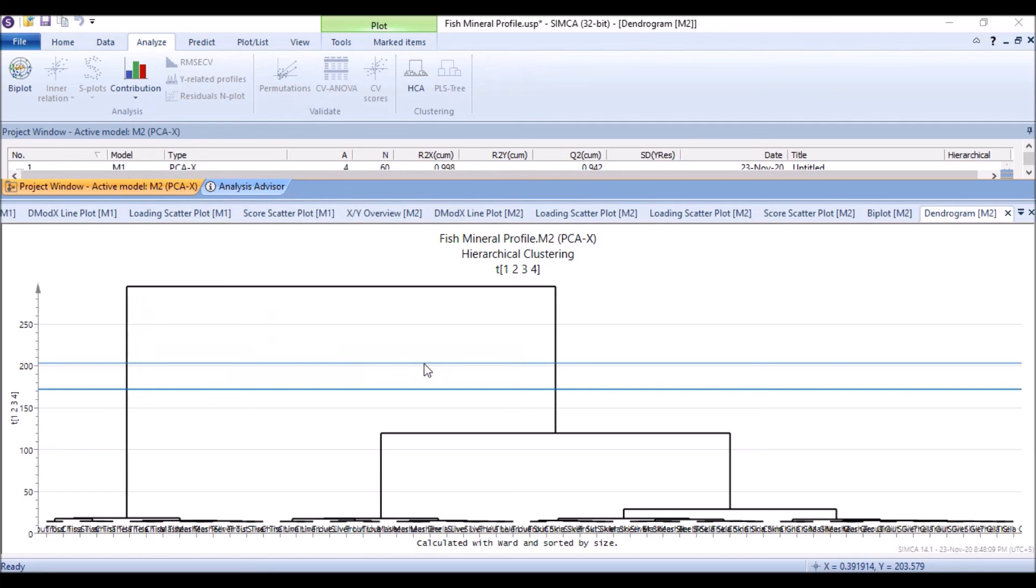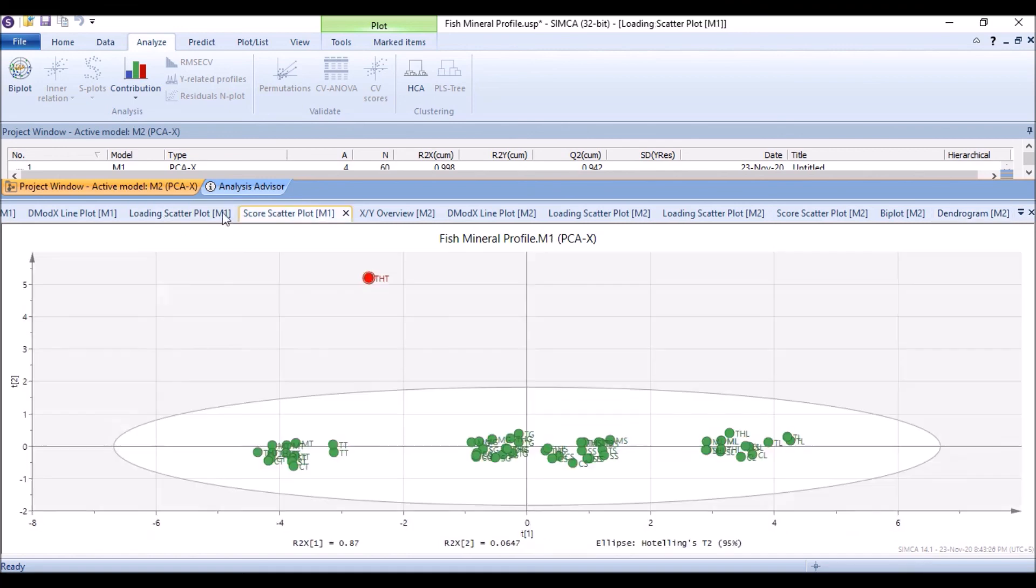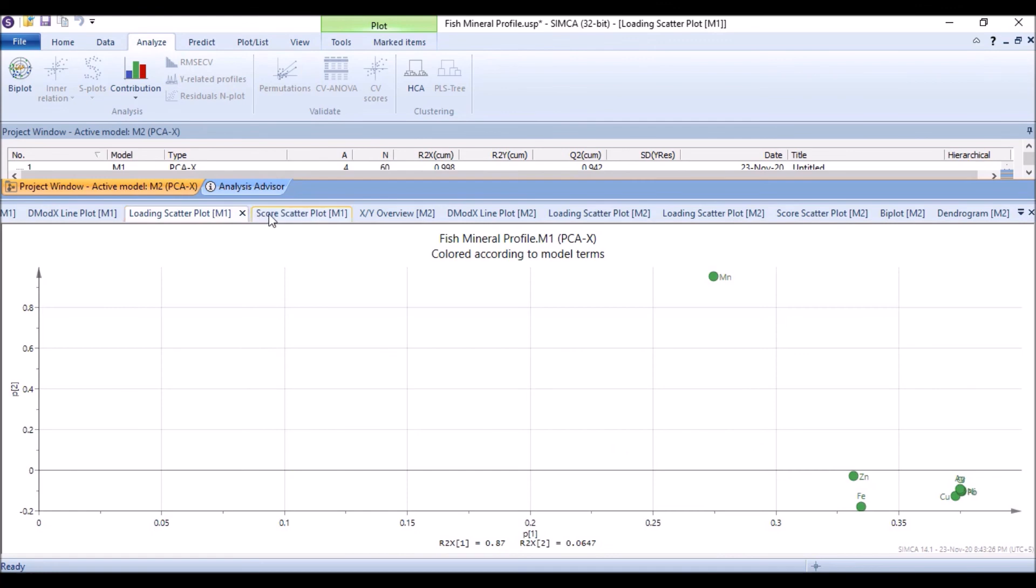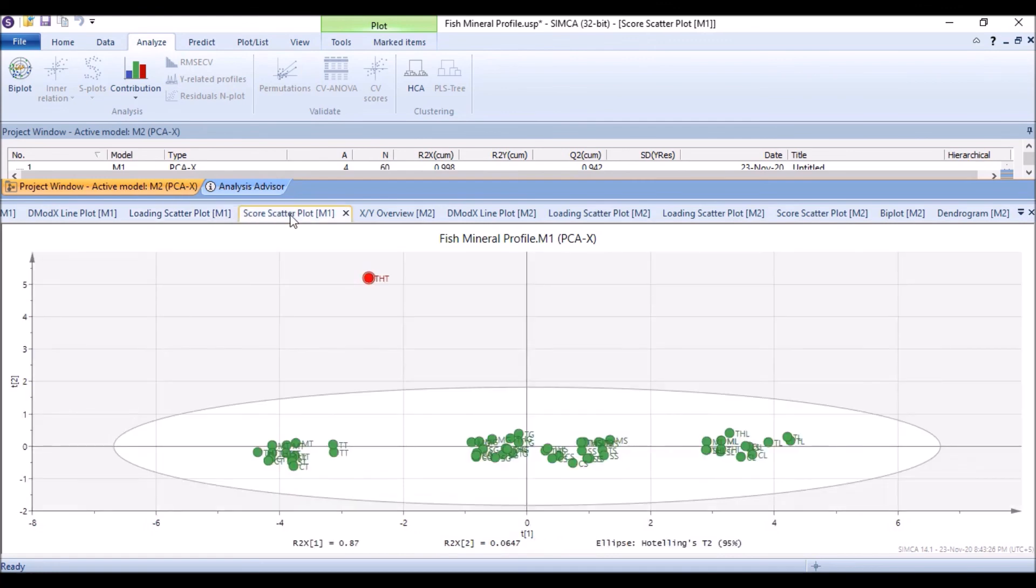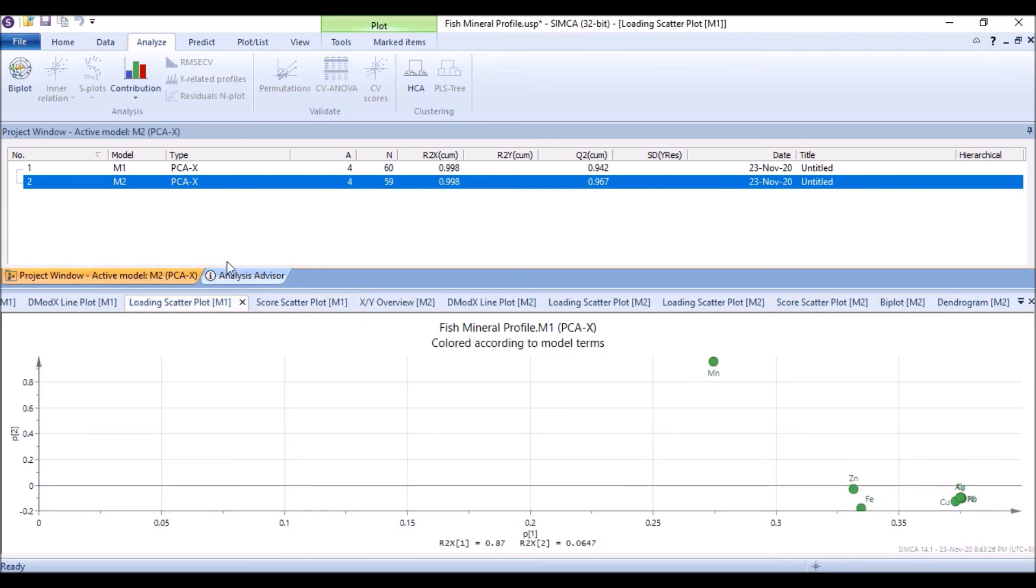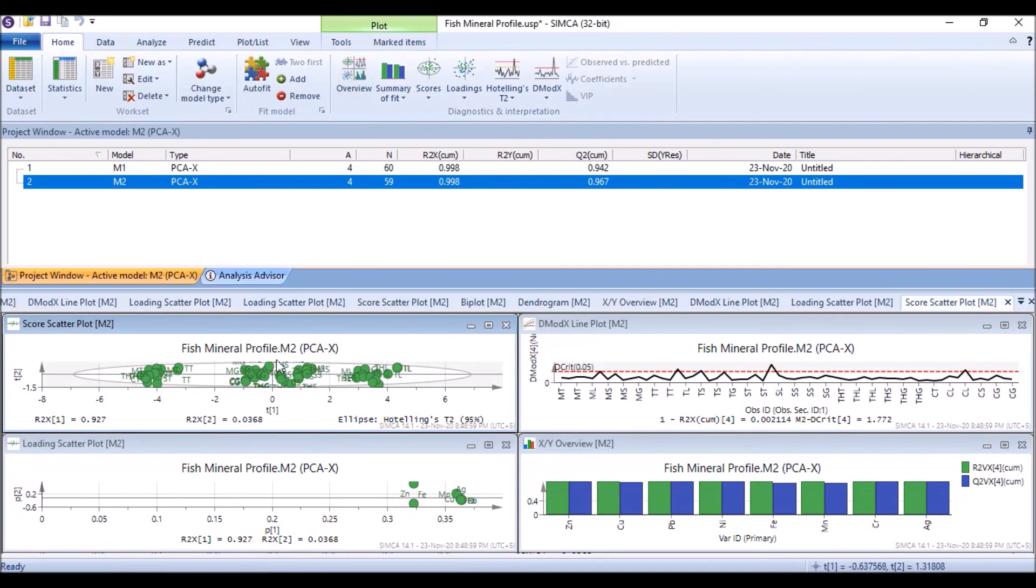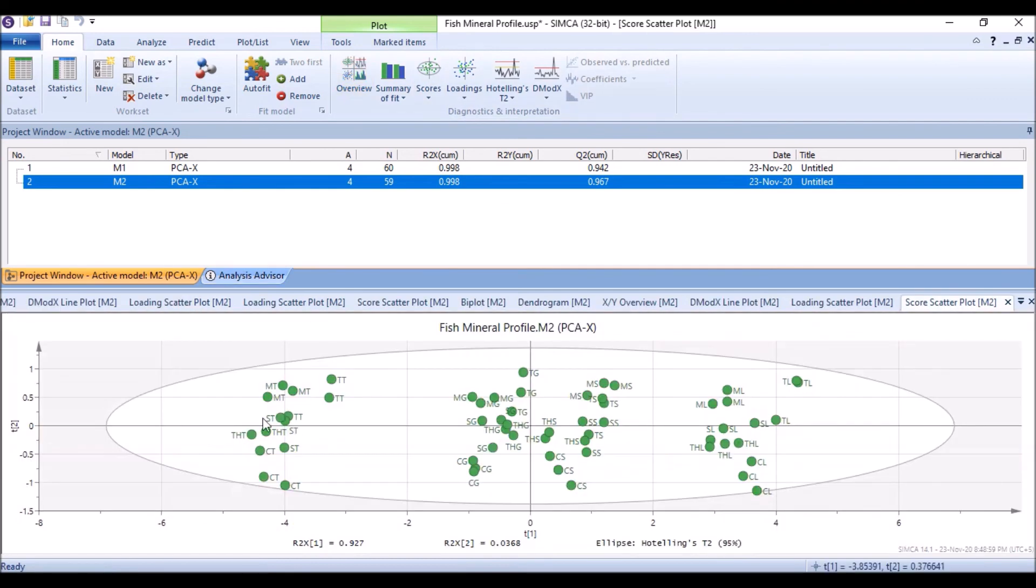In case if there is an outlier we can remove it to exclude. In case like here we see beautiful grouping, but sometimes we don't see these groupings or sometimes our need is a bit different, our target is different. This was our part, we take its overview, and this was our segregation and separation.